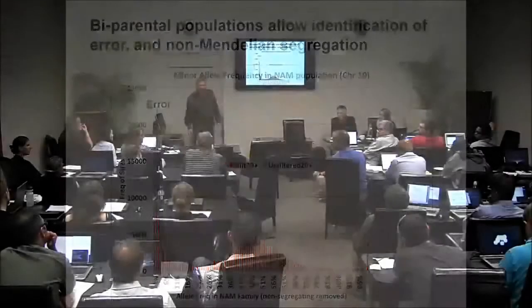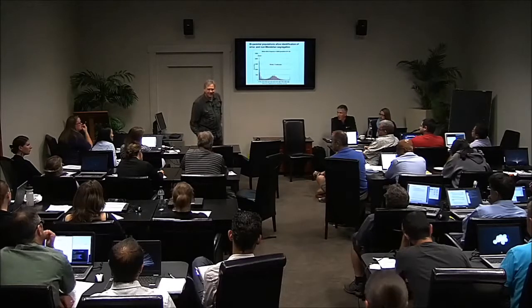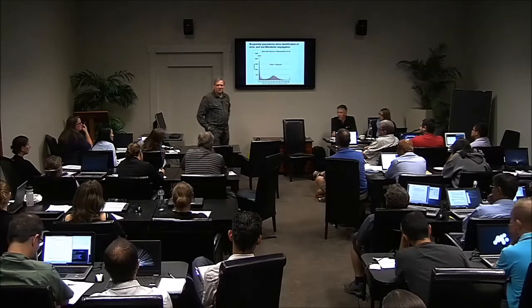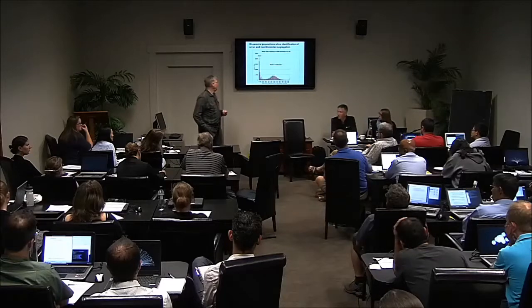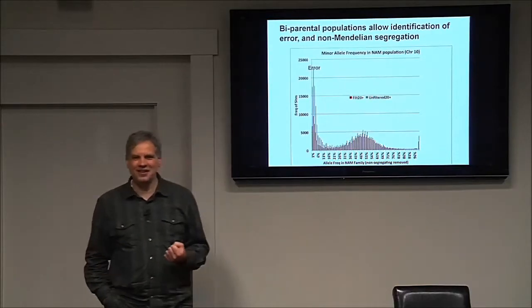This is all where there's no presence-absence variation. Yes, because when we run it through the pipeline, we don't call that stuff at first. We just call SNPs. So the presence-absence we throw on later. I'll be talking about that at the end of the talk here.